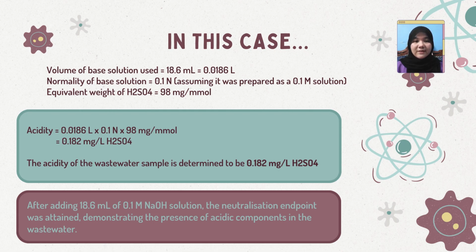With the result, the findings of the acid-base titration showed that the wastewater sample had a specific level of acidity. After adding 18.6 ml of 0.1 M sodium hydroxide solution, the neutralization endpoint was attained, demonstrating the presence of acidic components in the wastewater.